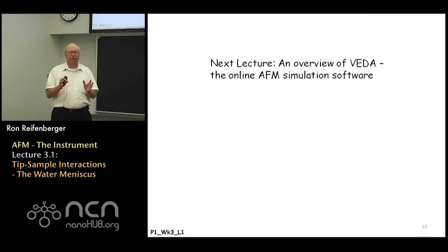And I'll end this lecture by just saying that when we come back, what we're going to do is provide a brief overview of VEDA. This is the atomic force simulation software that's been developed by Arvind Raman and his group here at Purdue University. We're going to start to walk through how to use this software and try to provide some information for you to make sure that you understand how the software works. This is going to be important as the lectures move through into the 4th and 5th week of part 1.